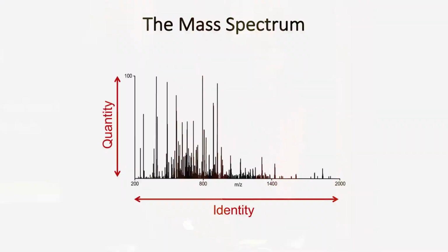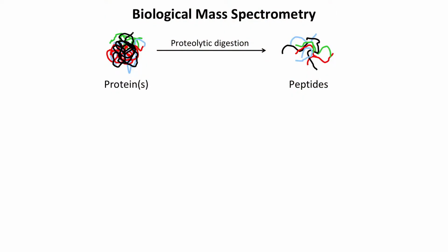And because I will be talking about mass spectrometry, I would like to spend 3-4 minutes to very briefly go over how we sequence proteins and peptides by mass spectrometry. Usually we take a protein, much like the immune system, in order to detect it or use it for anything. As mass spectrometrists, in most cases, we have to chop it up into peptides, because peptides are easier to separate and peptides are easy to sequence. Intact protein mixtures, not so much. But once you have a peptide mixture, might it be based on enzymes that we use to cleave those peptides, or might it be that the proteasome generated peptides.